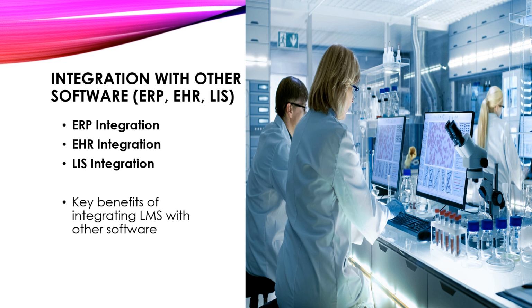Enhanced patient care. Now, integration enables seamless information sharing between departments, resulting in better coordination of care and improved patient outcomes. However, it is very important to note that successful integration requires careful planning, compatibility assessments, and collaboration between IT teams, vendors, and stakeholders. Additionally, adherence to data security and privacy regulations, such as HIPAA in the United States, is essential to protect patient information throughout the integration process.